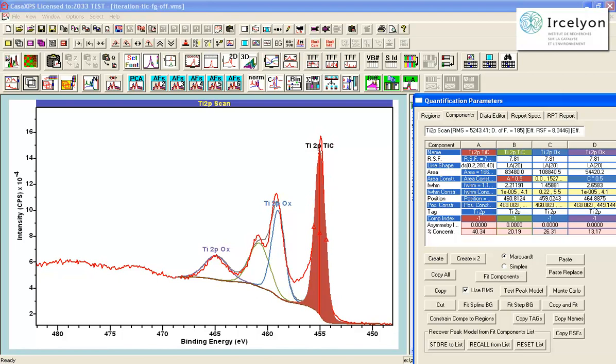And that provides an asymmetry which is appropriate in some sense for use with a Shirley background that's calculated from data. If we didn't subtract off the Shirley background from the line shape, then that DS line shape would be infinite in area, and that's not very useful when we're trying to estimate intensity.